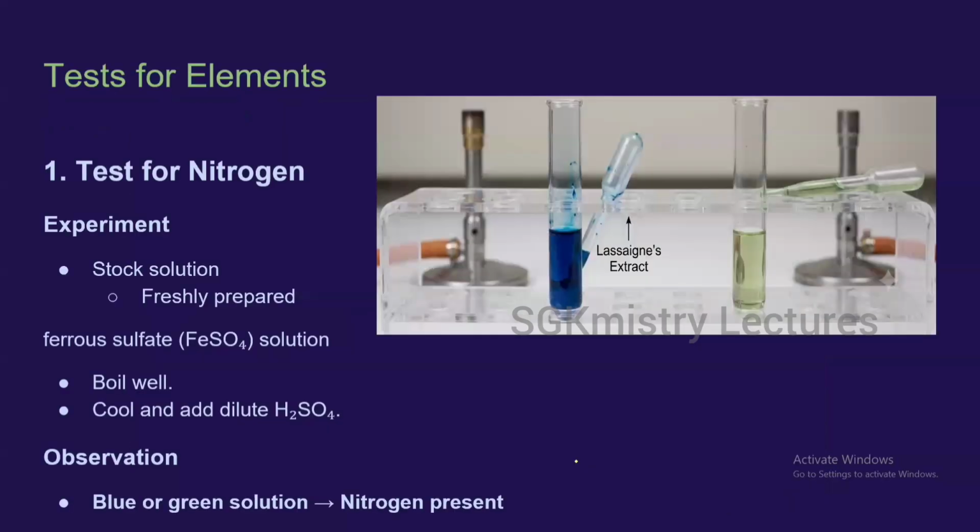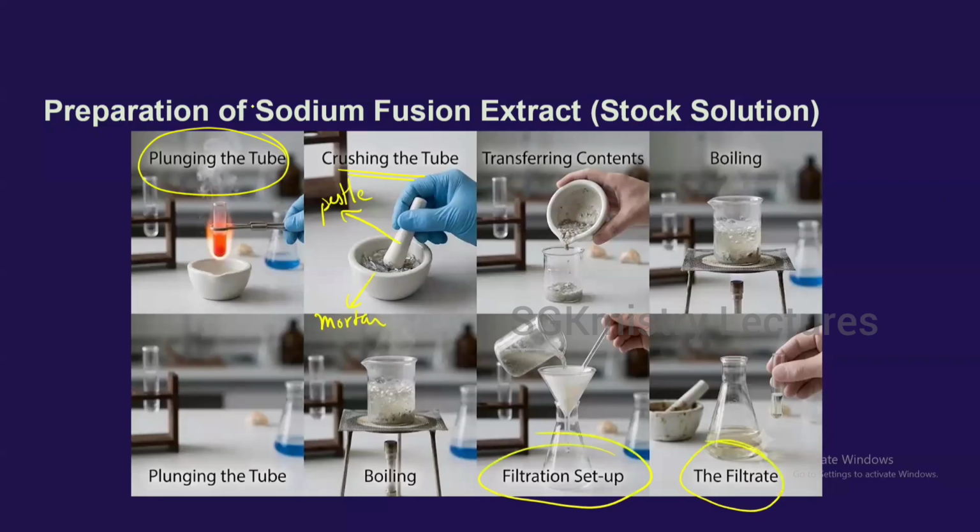Now using the stock solution, you're going to test for the various elements, especially nitrogen, sulfur, as well as halogen. Before that, let us see what happens during this sodium fusion extract preparation.